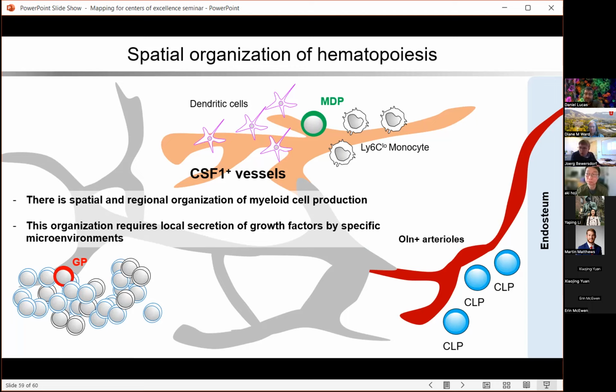So we developed a new method, which we are about to put on bioRxiv in 2-3 weeks, which should enable exchanging the colors in a CODEX manner much more easily without any harsh washes. We are currently establishing this for super resolution microscopy for subcellular structures, but I think the bigger impact in the end would be for tissue level imaging. So we are currently trying to identify possible applications where we could test this.